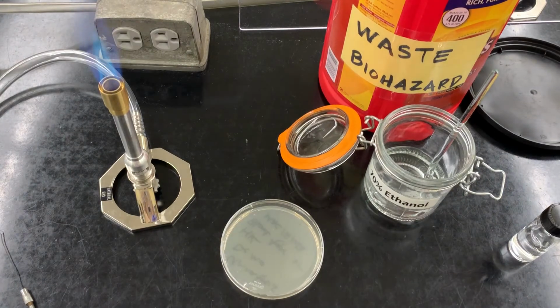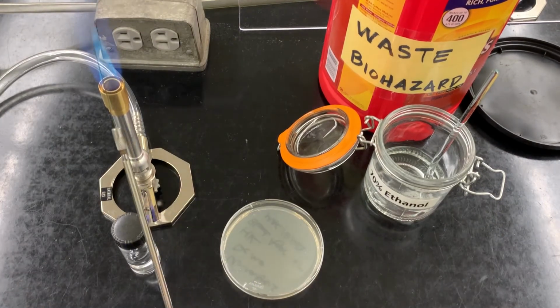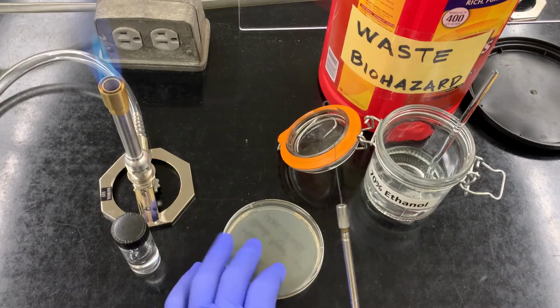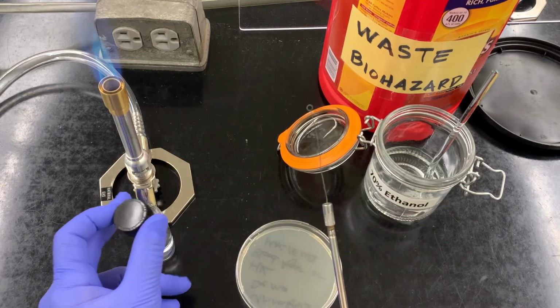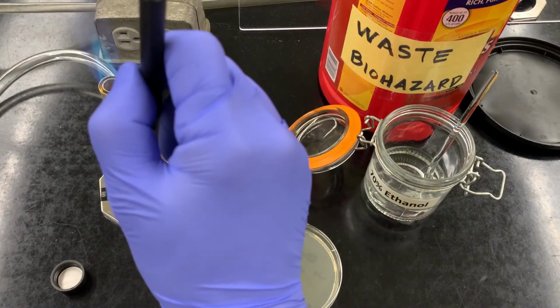That's the spreader method. The other method that we can do, I'm going to bring my fake urine back. I'm going to sterilize our loop, is using a loop. So that you would do if you don't have a spreader. And sometimes when people break our spreaders, we don't have spreaders. So if you are instructed to do the loop method, it starts the same, of course.